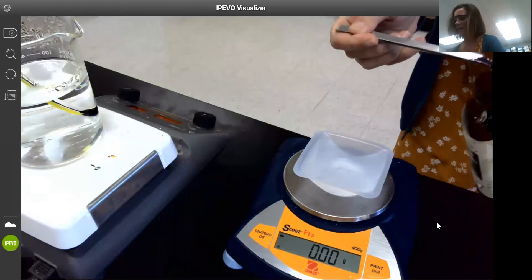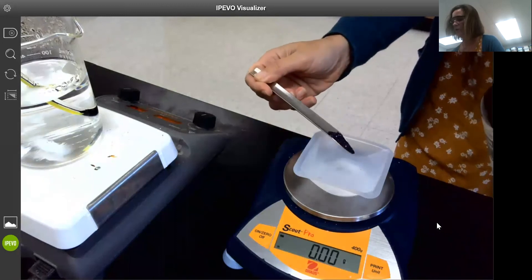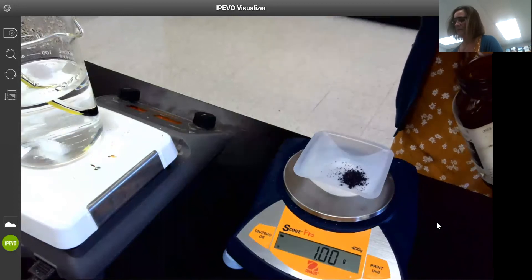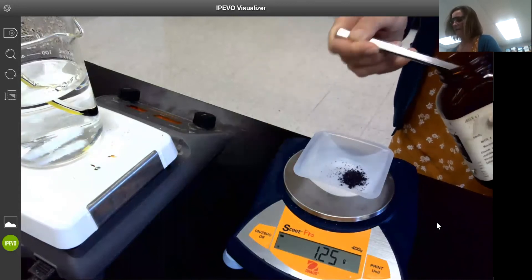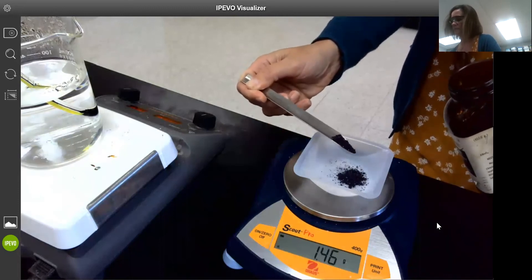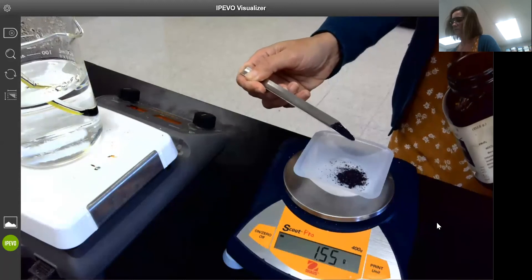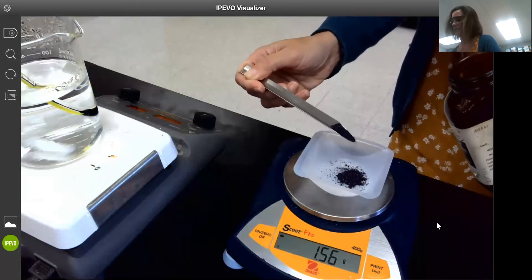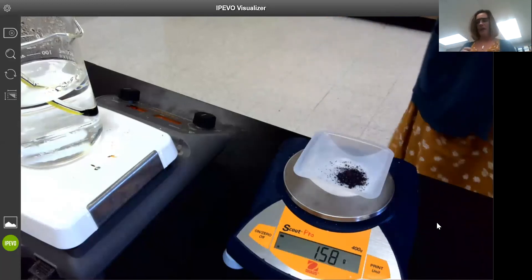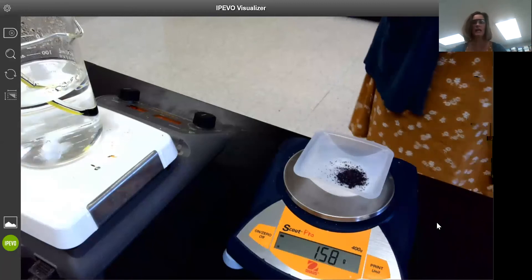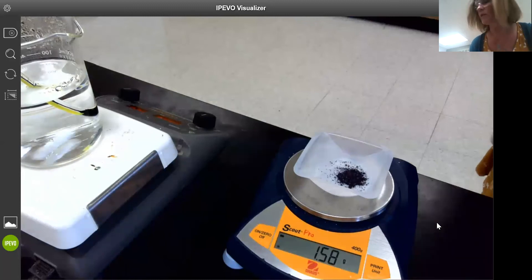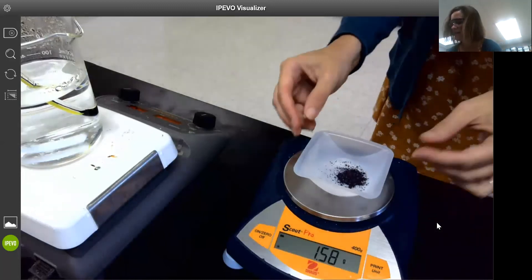Almost there. Go ahead and record that value: 1.58 grams of potassium permanganate plus or minus 0.01. Just as a description, it is a little bit hard to see in here, but it is a crystalline solid, it's purple in color and it's a little bit shiny.